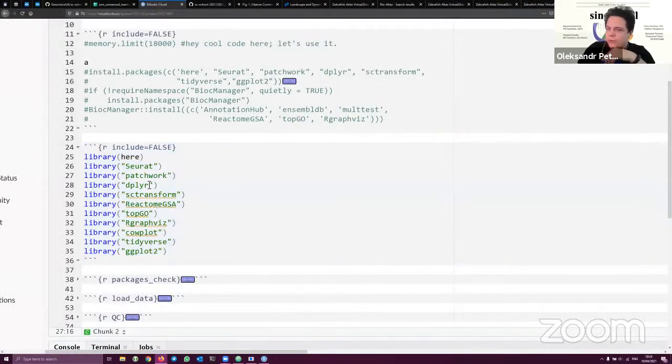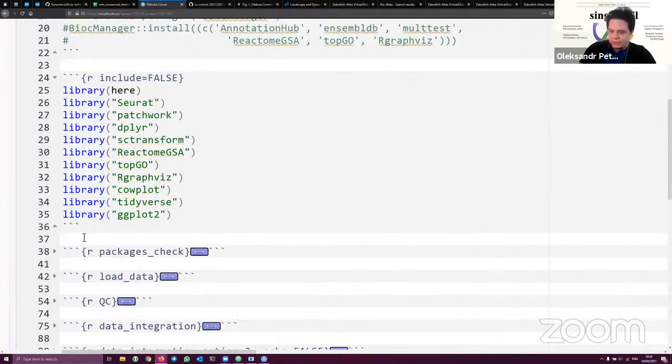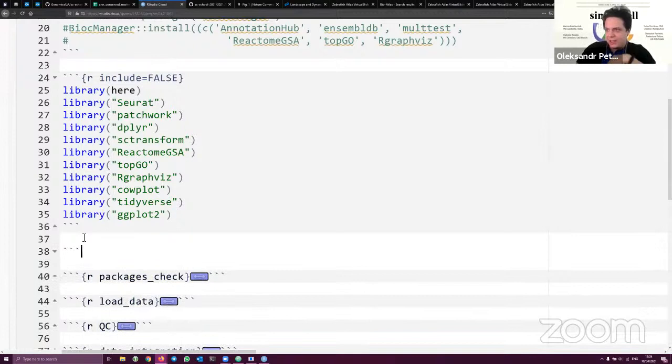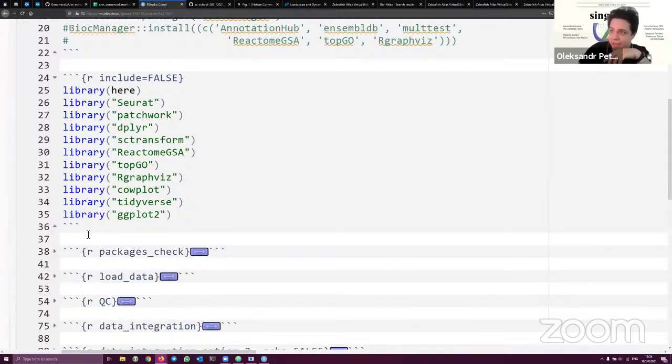Any code you write with R in the markdown should be starting with this and closing with this. If there is an unequal number of the closing or starting markers, for example, if I add an extra one, that means your notebook is broken, and you cannot write any more code. So make sure you have equal numbers of opening and closing markers.